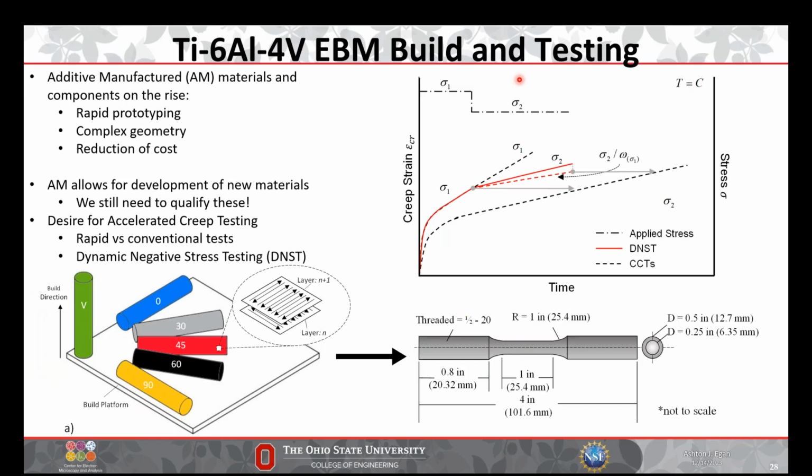So just to give a quick background on what exactly the problem is that we're trying to solve. They have some Ti-64 electron beam melted builds. So basically you raster an electron beam to build up layers of material by introducing powder, melting it, more powder, and then you just do this for many layers and make a thick sheet of metal, basically, or a block of metal. And so additively manufacturing like this is gaining popularity. I mean, has gained popularity.